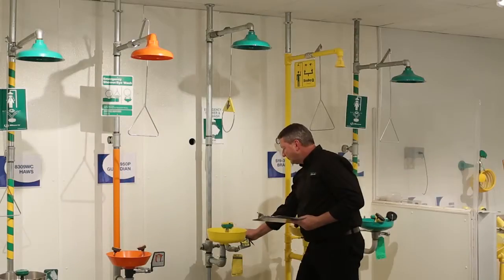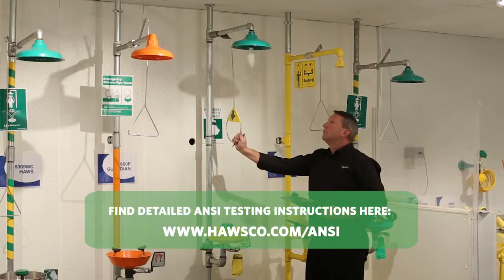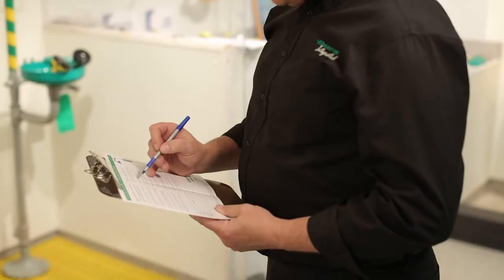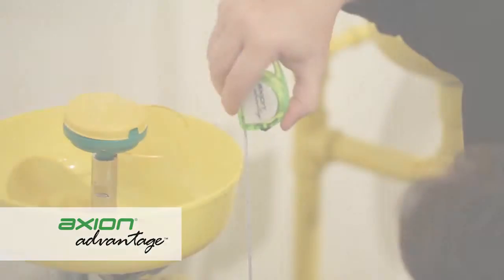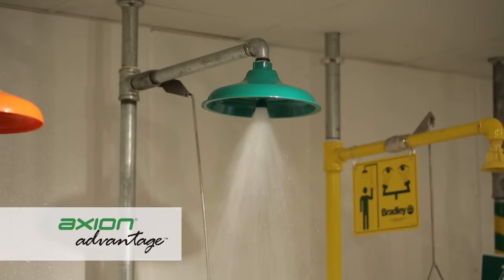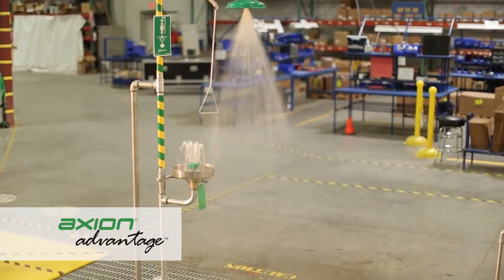Once you have completed your upgrade, it is important to test for ANSI compliance. For step-by-step instruction on how to test, refer to the ANSI checklist supplied with your system. With the new AXION MSR products installed correctly at your facility and tested for ANSI compliance, you can take comfort in knowing your site will have the only medically superior response at the critical moment it is needed.